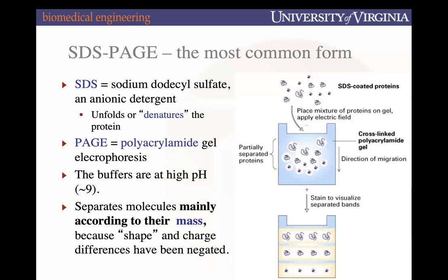And so whenever you see it, you'll have a standard ladder that shows, typically up here, 200 kilodaltons, 100 kilodaltons, 70, 60, 50, 30. And so we separate by size or by molecular weight, and the units for that are kilodaltons.